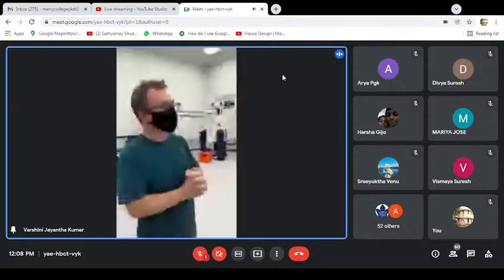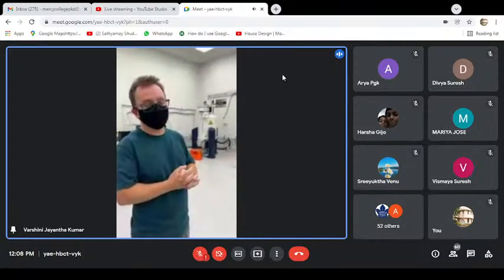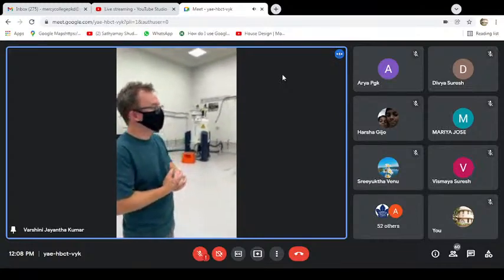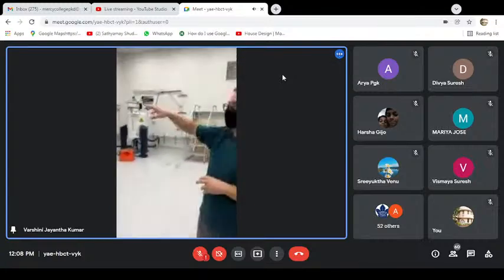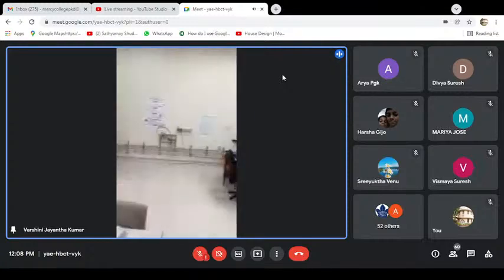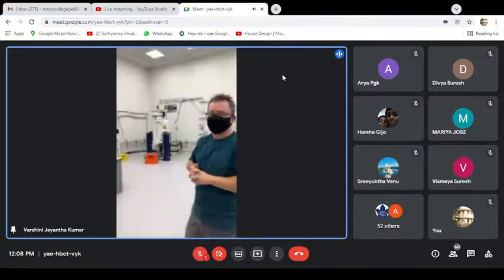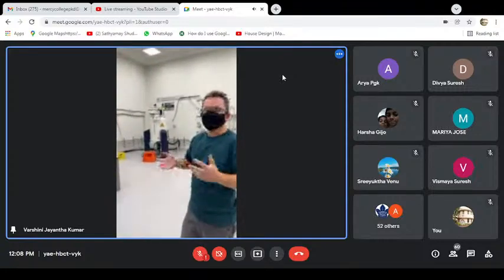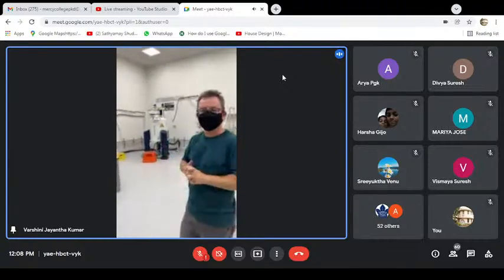So people can just come and put their samples on and run them in the queue and come back later and collect their samples and their data. And then we've got two more, the 500 megahertz and the 600 megahertz over here, both of which are, again, for solution work, and they're for more detailed studies on the molecules or the proteins or whatever the sample is that you're interested in.